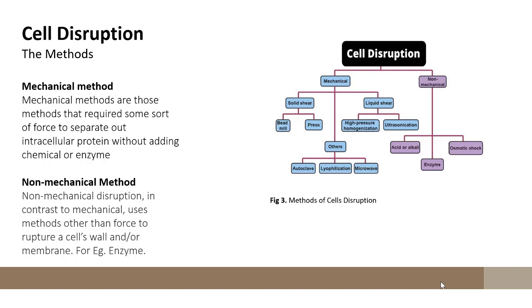For example, enzymatic lysis uses enzymes to disrupt the hydrophilic and hydrophobic bonds in the cell membrane. Detergents and chemicals work in a similar fashion.